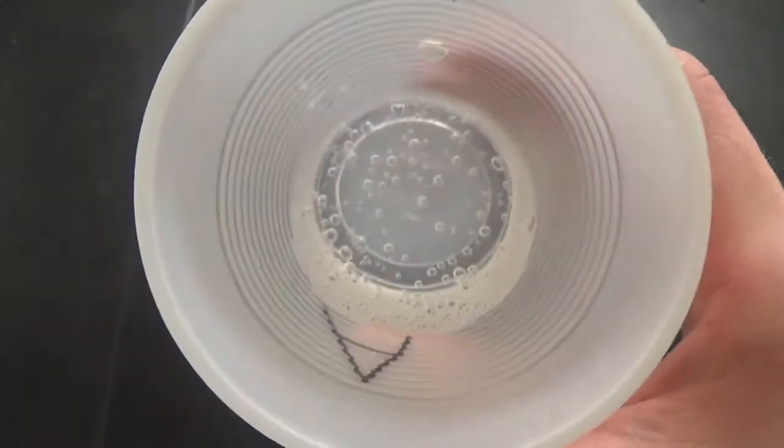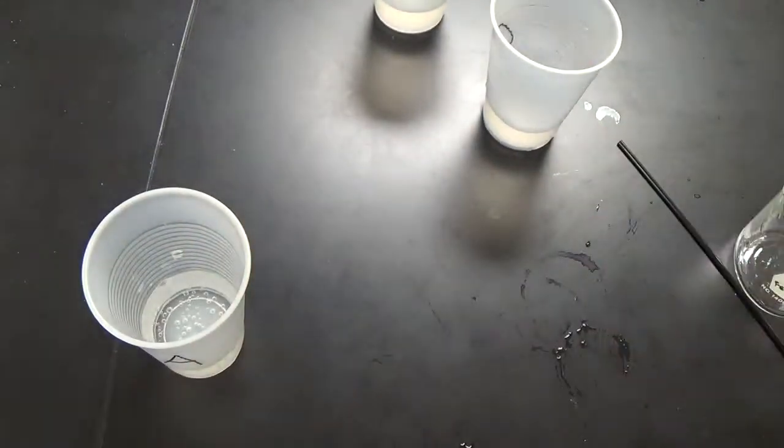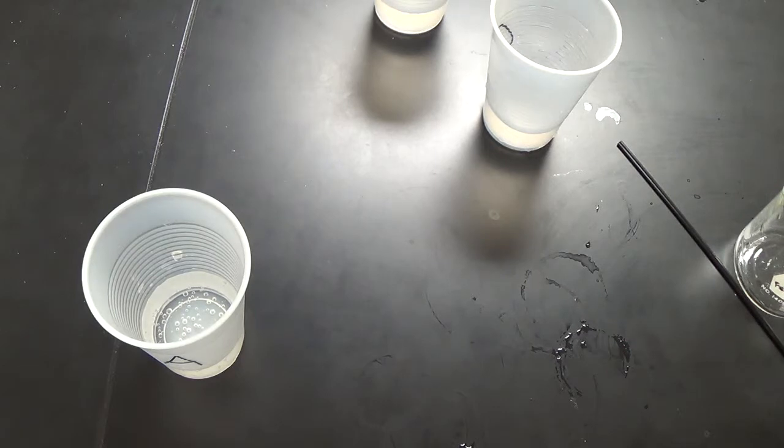All right, and then there's our control still hanging out there. All right, so make your observations in your chart, rank them, which one left first, which one left second, and then the third is the third, obviously. And you have a bunch of analysis questions to answer. Keep in mind, what we did in this part of the lab, part B, is the reverse of what I'm going to ask you. I'm going to be asking you what would be good to help it dissolve. So I think the question says that very carefully. Be sure that you think of it correctly, though. Good luck.